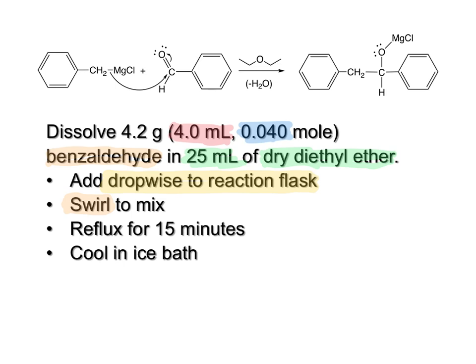Once it's all added, we will reflux that for 15 minutes, and then cool our product mixture in an ice bath to get ready for the next step.